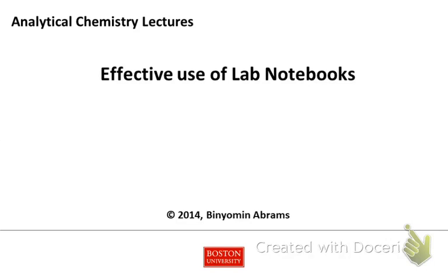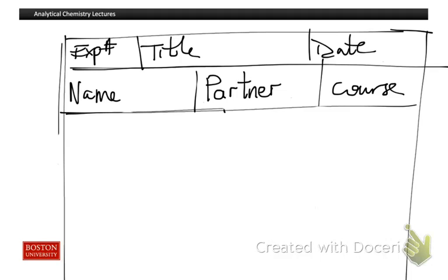Hi everyone, this video is going to talk about lab notebooks and how to prepare them and make effective use of them in the lab. Different instructors have different approaches to lab notebooks, so this is only one possible way of preparing and using lab notebooks, but this is one that we feel is pretty useful and hopefully you'll agree.